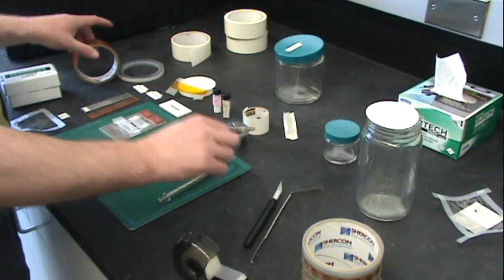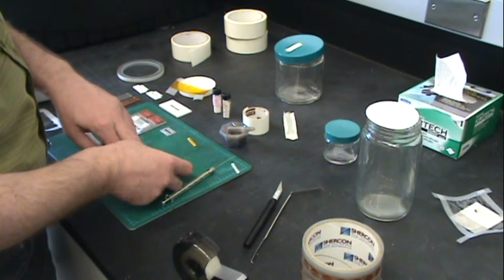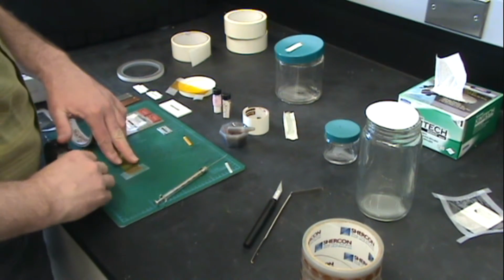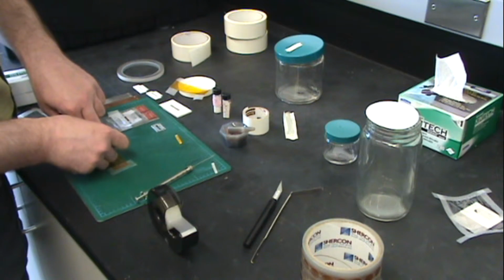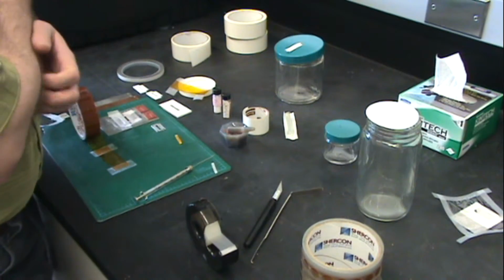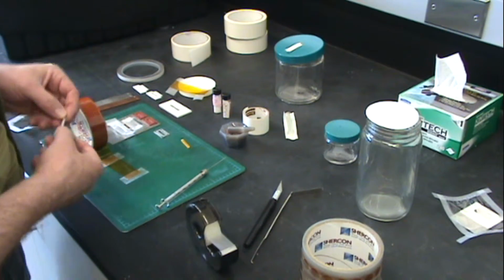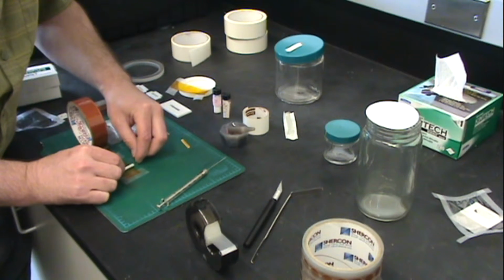So the way to make it, the safest way, is to take the very thin 1 mil thickness Kapton tape and then just tape it down one side and tape it down the other side. And just like for every other sample cell, the sample cell assembly can take place outside of a box from your sensitive sample. And generally what I like to do is carefully put it on.